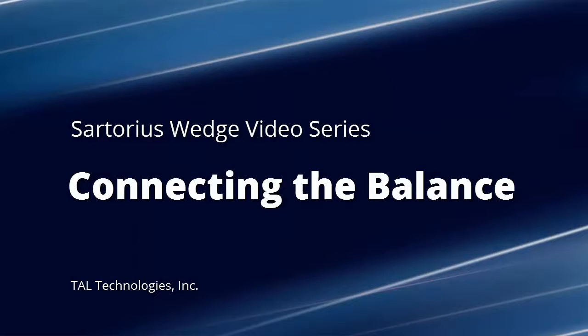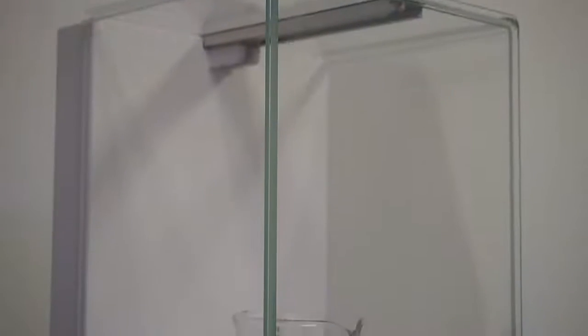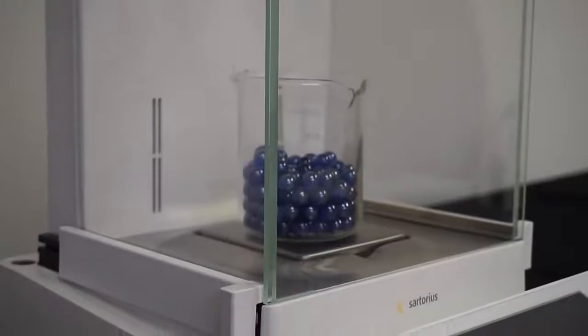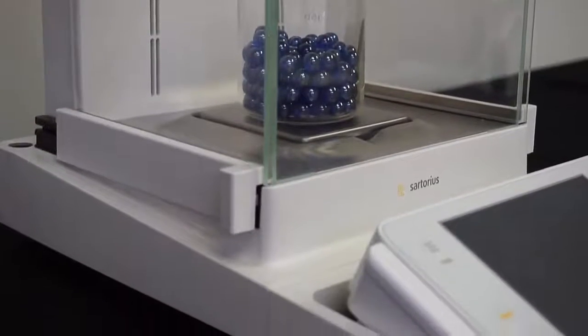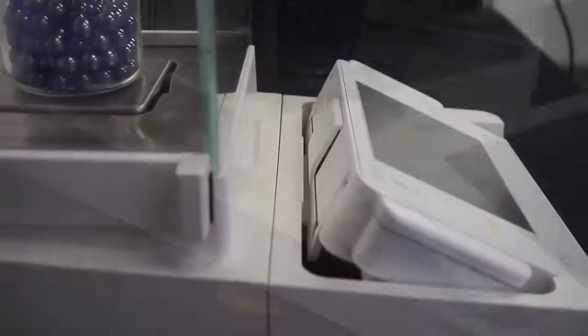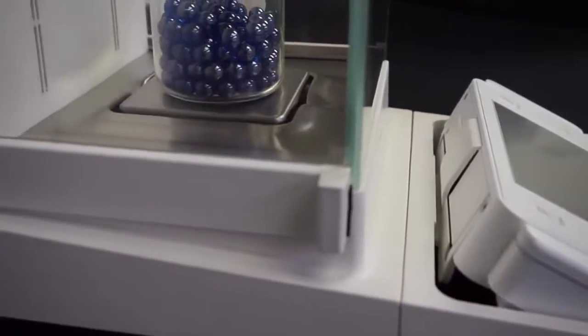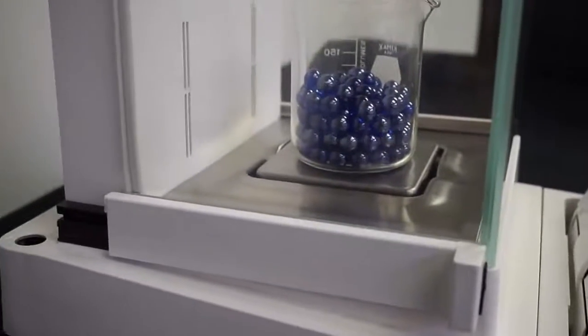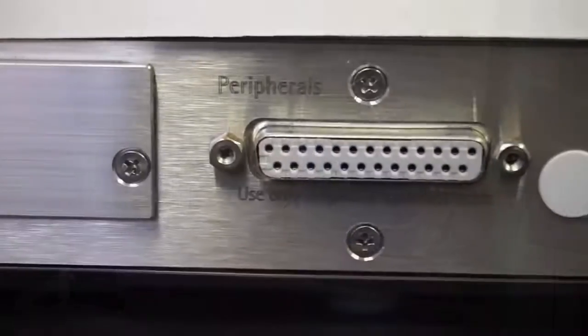In this first video, I'll show you how to connect your Sartorius balance to your PC. Sartorius provided us with the Cubis analytical balance, so that's what I'll be using. Your balance is probably a bit different than mine, but the key points remain the same.